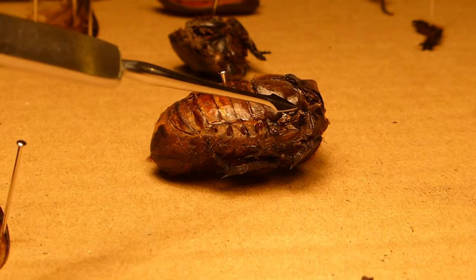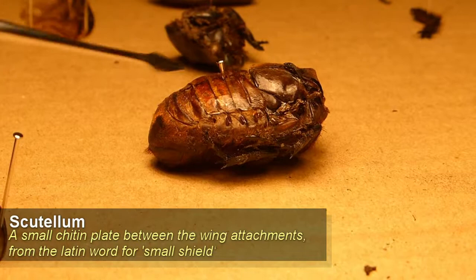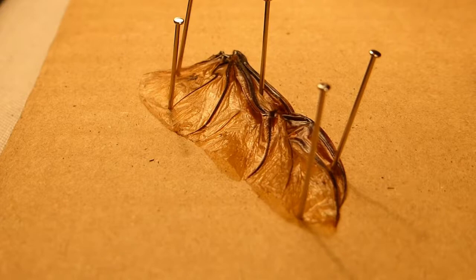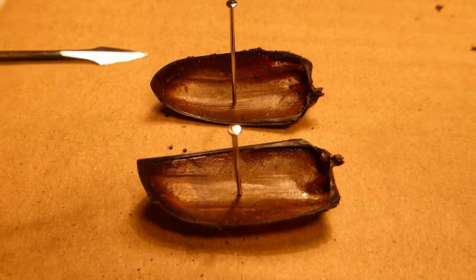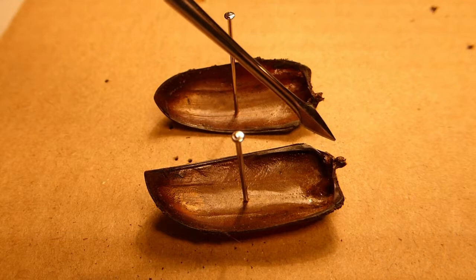Looking at the body here, you can see these are where the wing attachments are. As I said, there are two pairs of wings — the elytra attach here, and the flight wings attach here. This part is known as the scutellum, and this is the pygidium. The pygidium means rear part. This is one of the flight wings. You can see that compared to the beetle, this has a pretty decent surface area — about twice that of the surface area of the beetle in one plane. However, because of the mass of the beetle and how big and heavy it is, they're actually quite clumsy flyers. So these are the elytra — the pair of protective coverings, the armor, the exoskeleton of the beetle. These go over the main set of flight wings to offer protection.